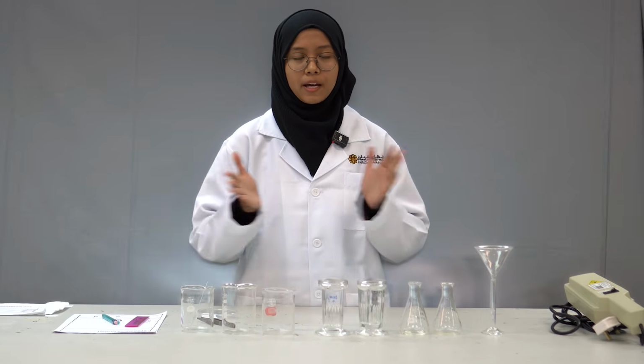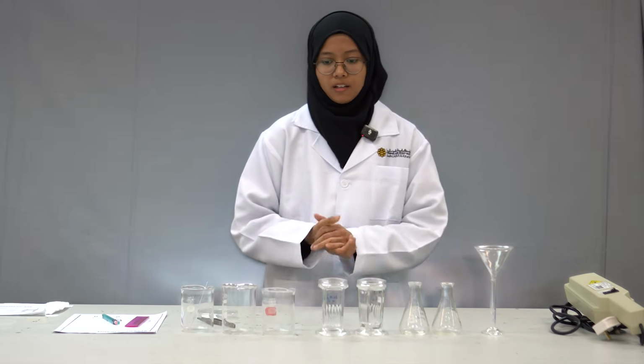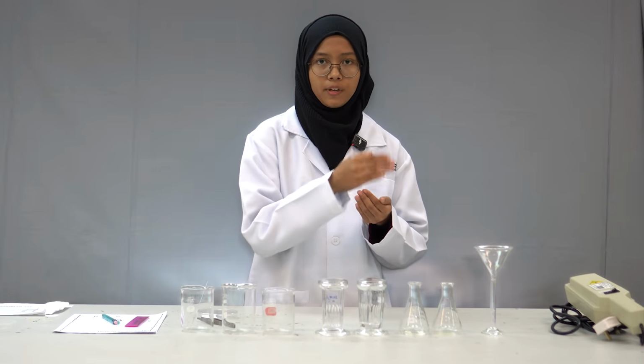So the principle behind this experiment is that each compound has its own polarity. That means the more polar the compound, the more interaction between the compound and the stationary phase.